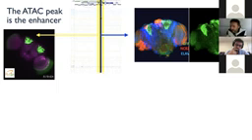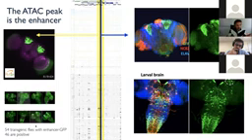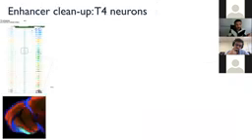Now, what's also interesting is that if you look in development, because remember, we had also done the developmental single-cell ATAC, in fact, during development this particular region is accessible in more cell types. And also, if we look at the GFP of this line, it's also active in more cell types. So it's getting narrowed down to one specific cell type in the adult. Like I said, we tested many of these regions and found quite a lot of positive enhancers.